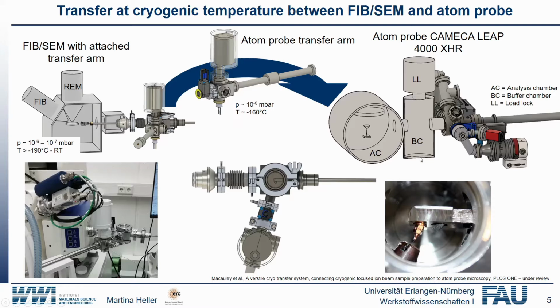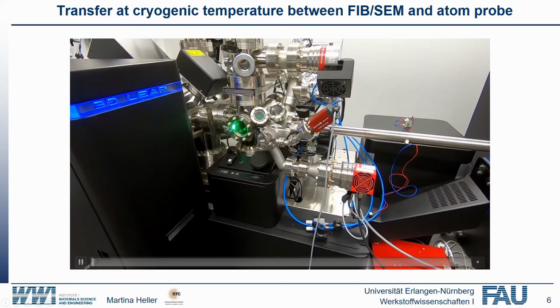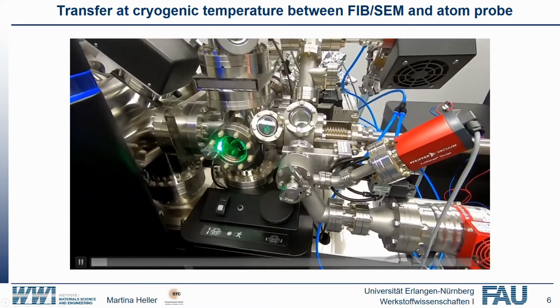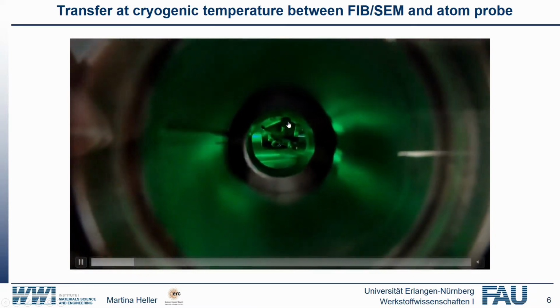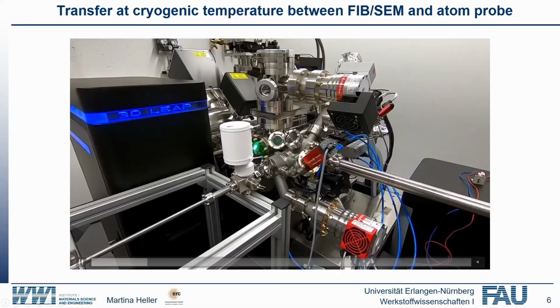In addition, we have here a cryo load lock attached to the buffer chamber of our LEAP. Inside the buffer chamber, with this additional part, is a cryo stage. So this is our LEAP, where I can see here the additional part, and inside is our cryo stage, which you can insert into the buffer chamber.